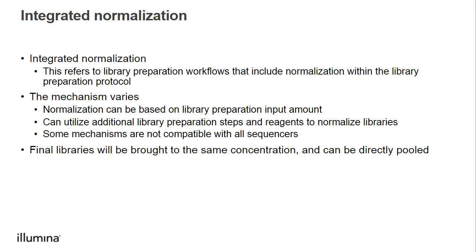Integrated normalization refers to library preparation workflows that normalize the libraries for us. Different library prep methods will use different strategies for this. Some will normalize the samples based on meeting certain input thresholds, and other preparation kits might use additional reagents and protocol steps to normalize the libraries. Not all library preparation methods include integrated normalization, and some integrated normalization methods are not compatible with all sequencers.